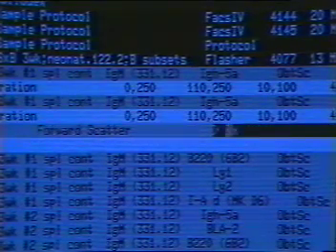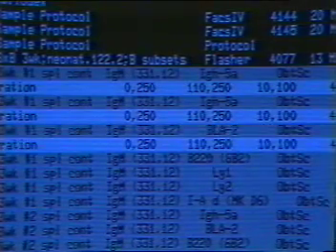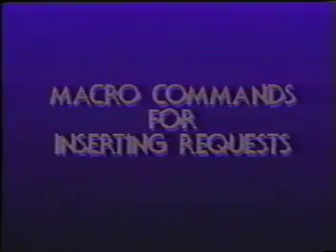When you press return after responding to the final sensor prompt, the secretary adds the new analysis request to the card. To request the same analysis to be run on many samples, you can save yourself time and effort by defining a macro command for the analysis.